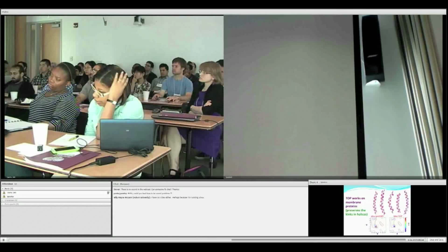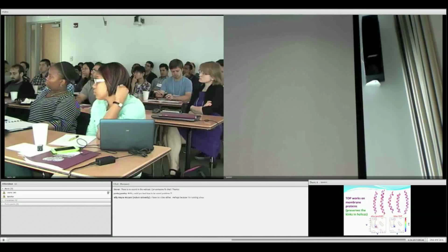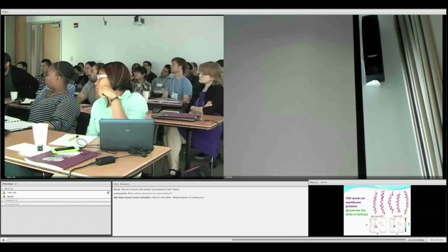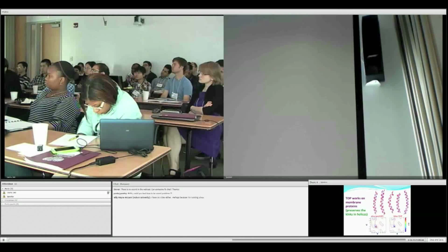This is the cytochrome b6f complex. This is a very important structure in photosynthesis. To begin with, when they deposited it, the resolution was 3 angstrom. We improved this also by a lot, and you can see that especially in this case, we improved the preferred regions from 83 to 91. If you wanted to do this by manual work, it would take you a long time to finish this.